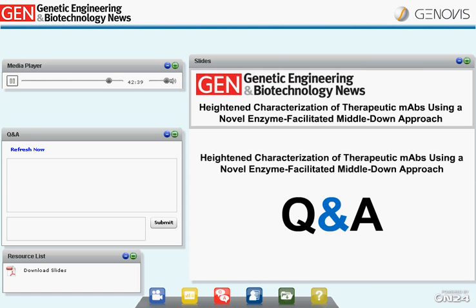Thanks. And this is a perfect segue to the next question. Someone asks, how is a Maxis MS calibrated, using a small molecule calibrant or a large biopolymer of known mass? Yes, there are a number of calibrants that can be used. Any of the mass spectrometers out there probably would have their own preference. We utilize the Agilent high mass calibrant, which is a small molecule calibrant.